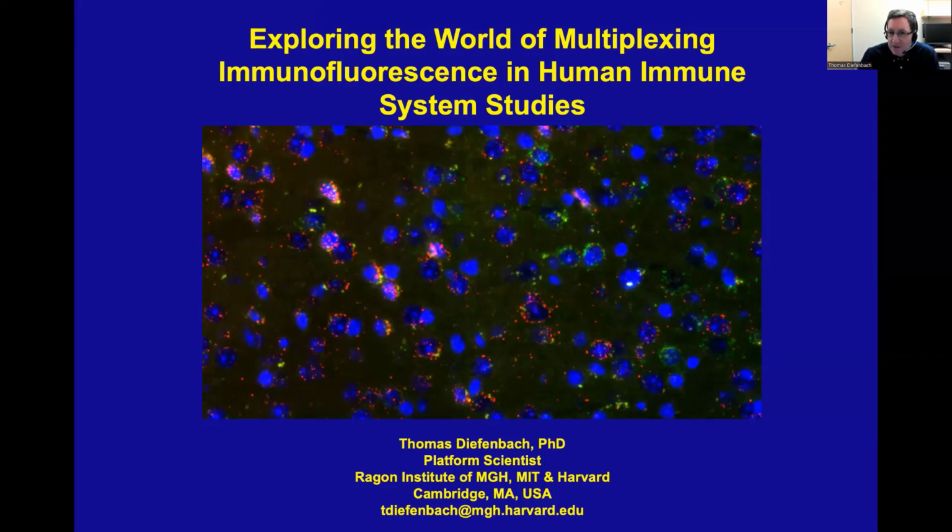We have a sister institution in South Africa, in Durban. So as a group, we're interested in looking at the immune system, looking at immune cells and phenotyping them, and looking at the infectious process in patients infected with AIDS. And the challenge of this is, of course, the number of markers that are often required. For example, in approaches using flow cytometry, which is what immunologists normally use to address these questions, at least for cells in blood, they would be using panels of markers anywhere from 15 to 30. We have a BD Symphony that looks at 30 marker panels.